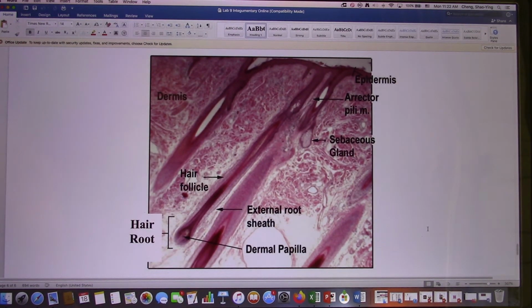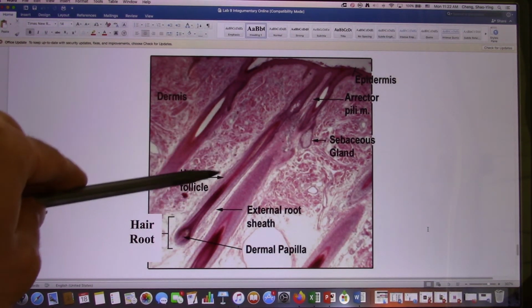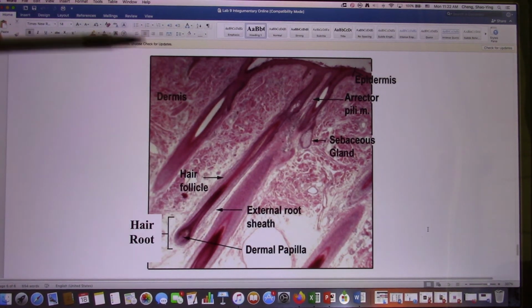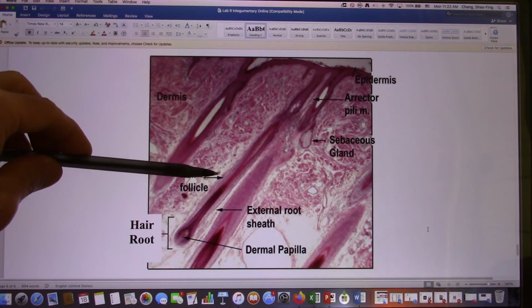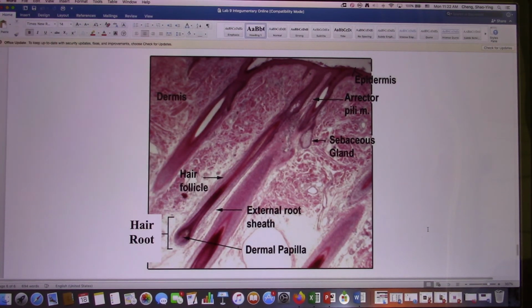And this histology tells you the hair structure. In the class, I explained the hair and hair follicle, they're different. So hair follicles are the supporting structure of the hair. So in this slide, it's pretty obvious. So you found those center, the darker one is the hair, and the outside, the lighter one is the hair follicle. So during the test, you need to be careful. If I point at the lighter one, that's the hair follicle. If I point at the darker one, that's the hair.